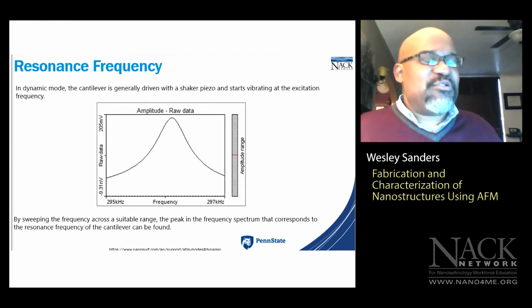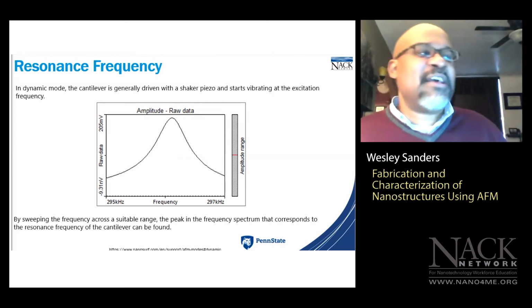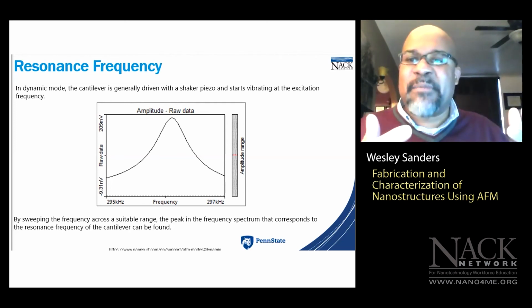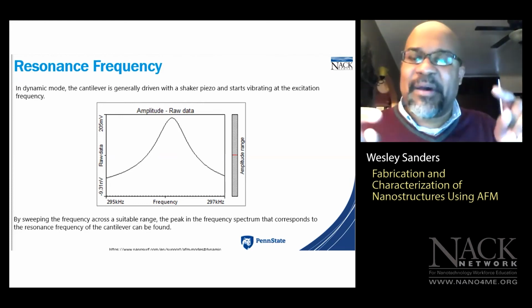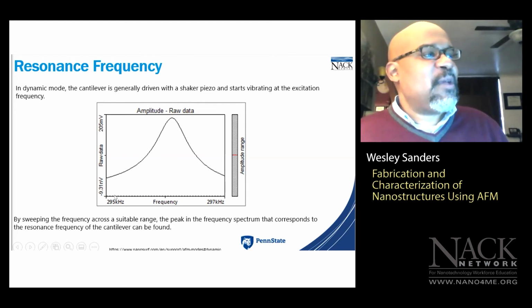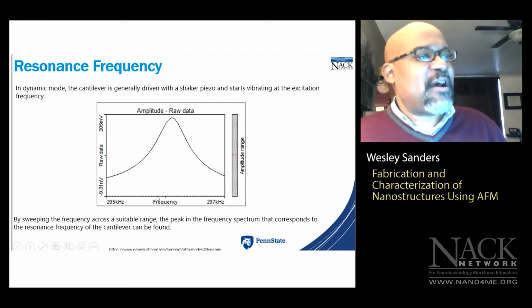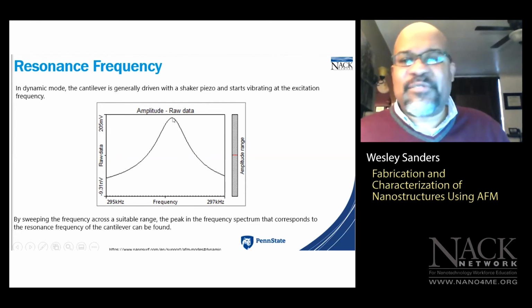So generally, when you use tapping mode AFM, one of the first things you do is you tune your cantilever. That simply means this AFM system automatically determines the resonant frequency, right? You just hit a couple buttons and the system determines the resonant frequency for you, okay? So this is a representation of some tuning data where you have your photodetector signal response versus the cantilever frequency. And as you can see, the resonant frequency gives us the highest photodetector response.